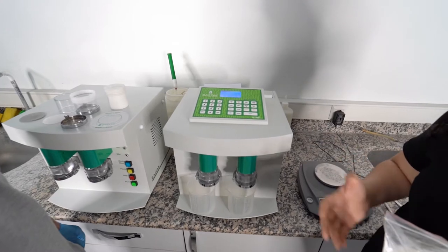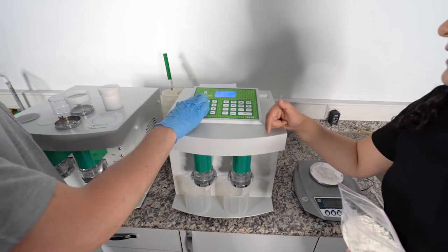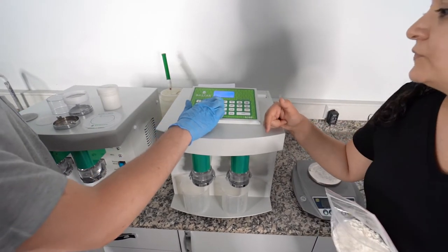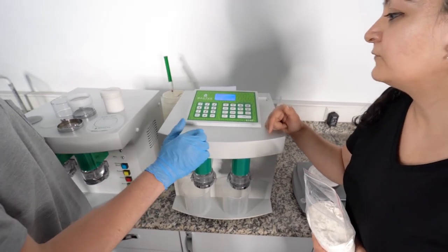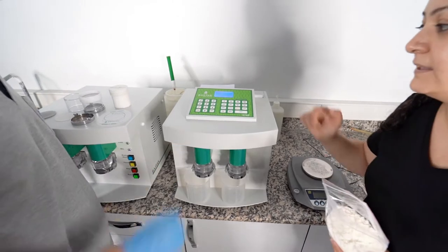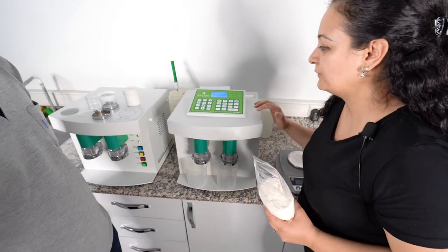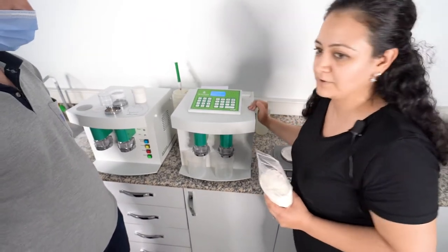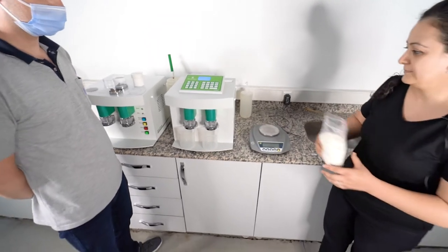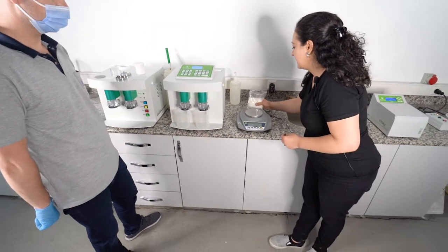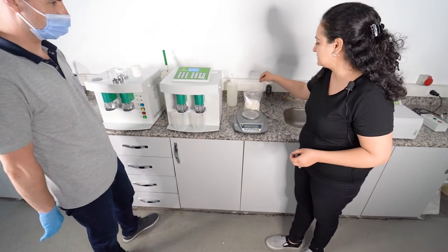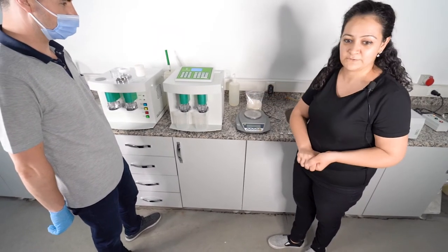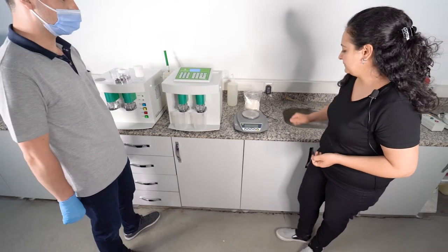But our moisture is different than 14, so we will enter our moisture 13.5. The machine says you should weigh 9.94 grams. You should take your sample homogeneously from different points, from five different points we can take our sample.